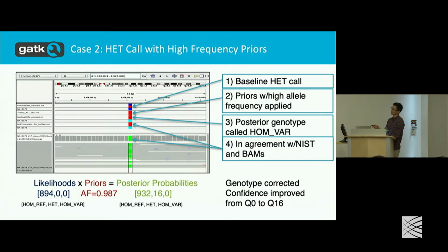I can actually talk to you offline and describe how this works. But this is pretty much saying it's the relative probabilities of each genotype. So you take the probabilities that add up to 1, divide everything by the highest probability, so you get 1 and something very small and something very small, and you take the negative log 10 of each number. So log 10 of 1 is 0. It's a nitty-gritty thing that we can talk about offline if you're interested.